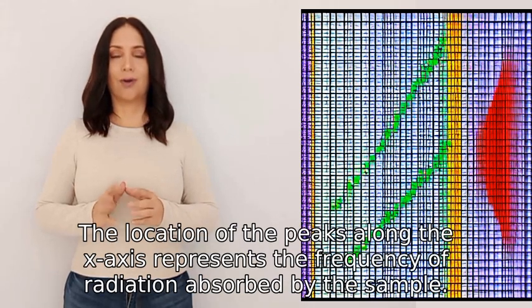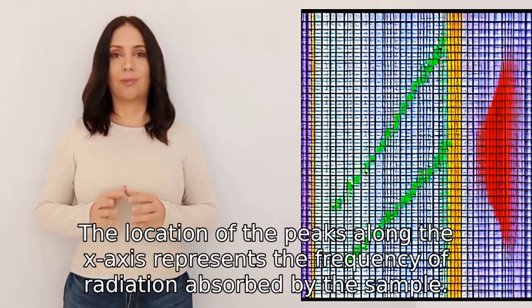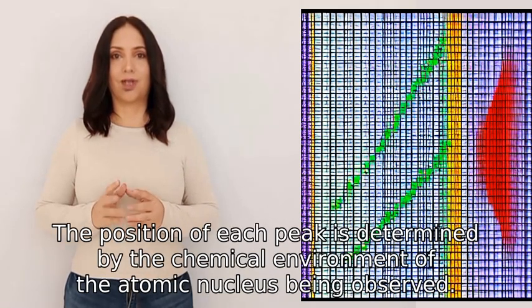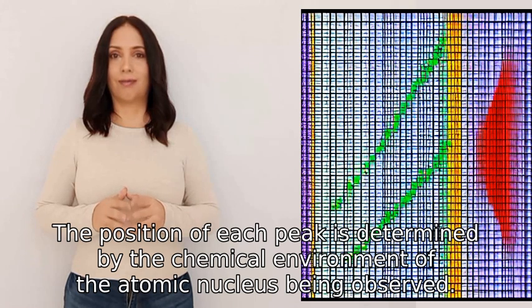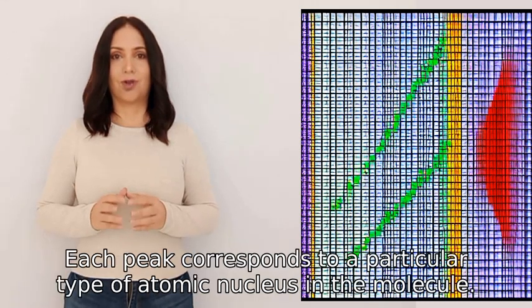The location of the peaks along the x-axis represents the frequency of radiation absorbed by the sample. The position of each peak is determined by the chemical environment of the atomic nucleus being observed. Each peak corresponds to a particular type of atomic nucleus in the molecule.